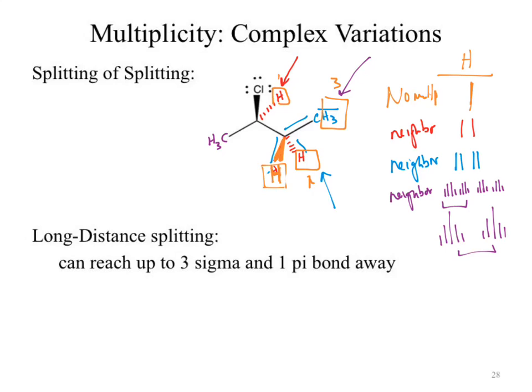But then those theoretically overlap. So the net result is that we end up seeing something that we might have predicted from the very beginning. For that hydrogen, how many neighbors do we have? 4, so we would have expected 5 peaks. Those 5 peaks are due to our uber complex splitting pattern that is now added and condensed on top of each other to result in the net result of only seeing 5 peaks.